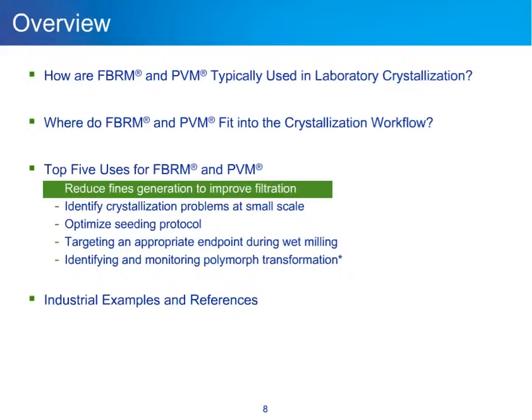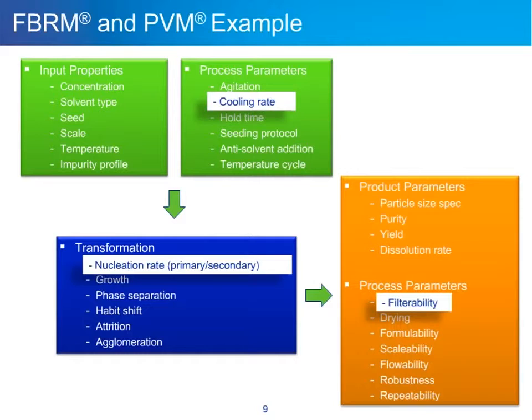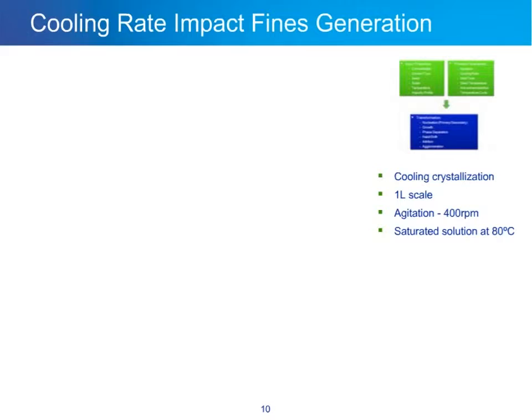Our first top-five example is reducing fines generation to improve filtration. The example focuses on changing the cooling rate while keeping everything else constant. This impacts the nucleation rate, which subsequently impacts filterability. We'll look at how exactly FBRM and PVM provide the information that ultimately leads to a more filterable process.